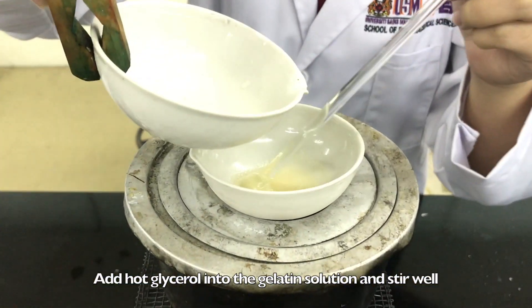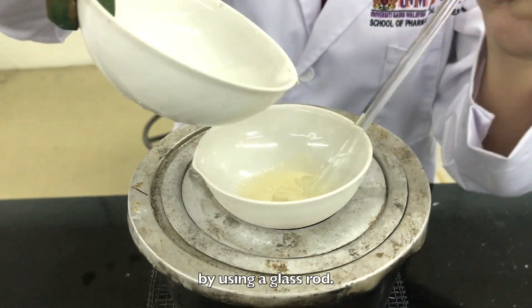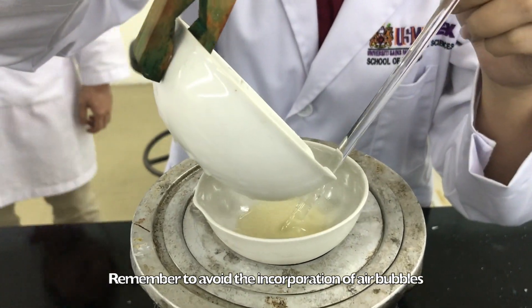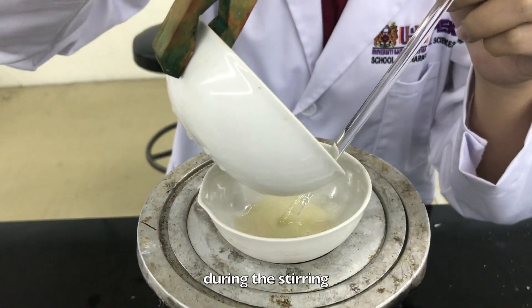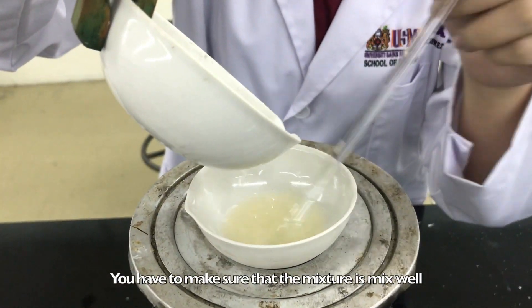Add the hot glycerol into the gelatin solution and stir well by using a glass rod. Remember to avoid the incorporation of air bubbles during the stirring. You have to make sure that the mixture is mixed well.